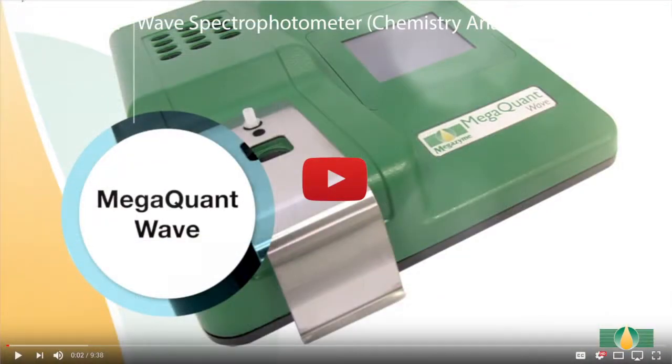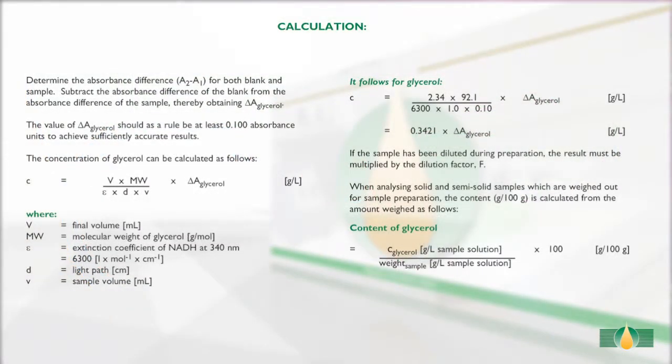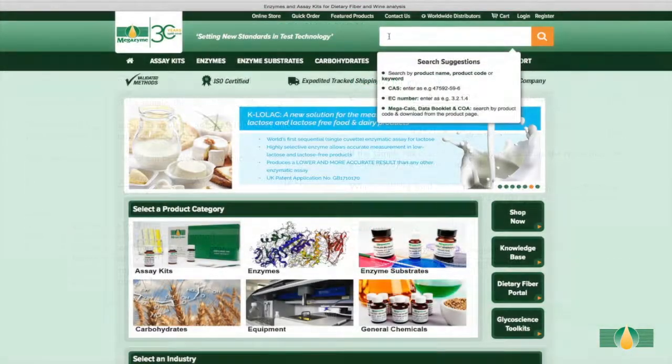Please see our Megaquant Wave video for further details. If the results output are raw absorbance values for both blank and samples, the calculations of glycerol content can be performed manually as described in the calculation section of the kit booklet.